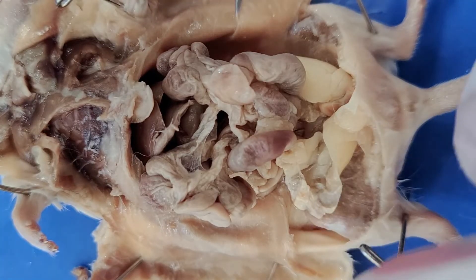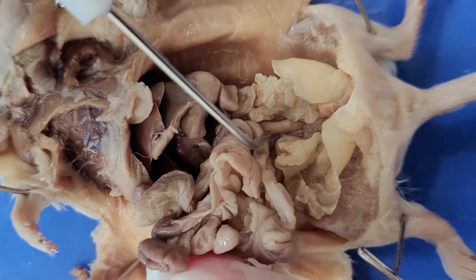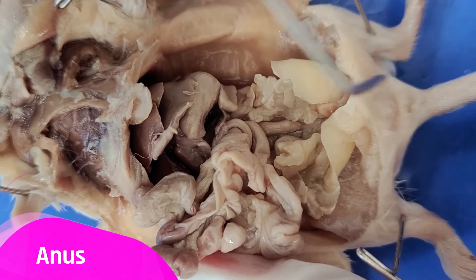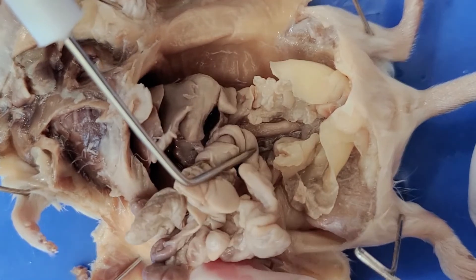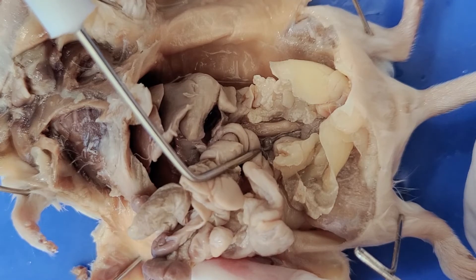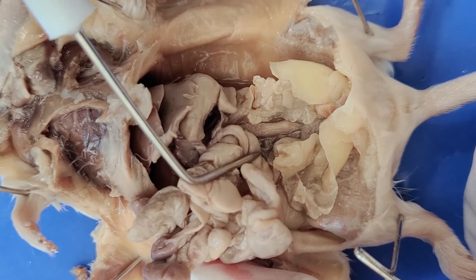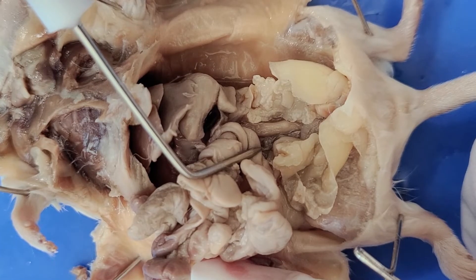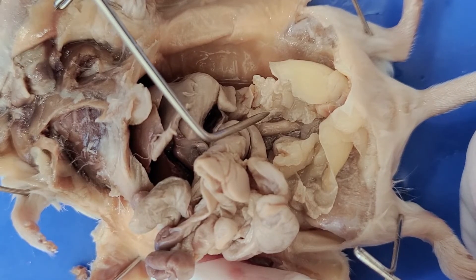Below the small intestine is the colon, which is this tube you see here, that extends from the small intestine and leads into the anus. The colon is also known as the large intestine, and its main function is to absorb excess water — not only from the food you ate, but also the water in all the secretions made by the various digestive organs along the way. After this, the colon also stores the waste until it's ready to be eliminated via the anus.